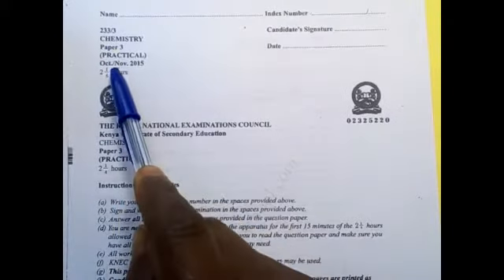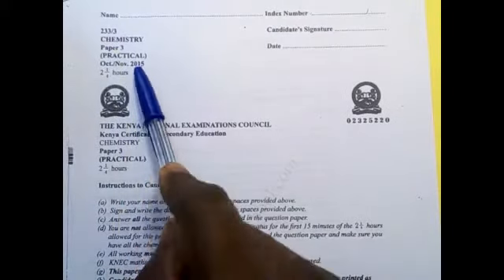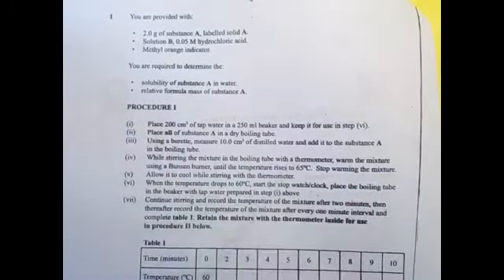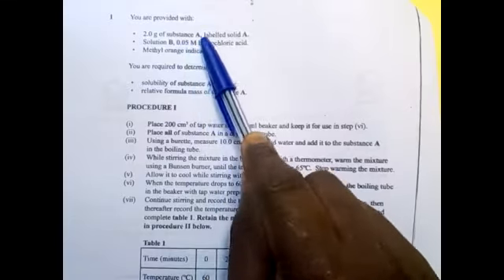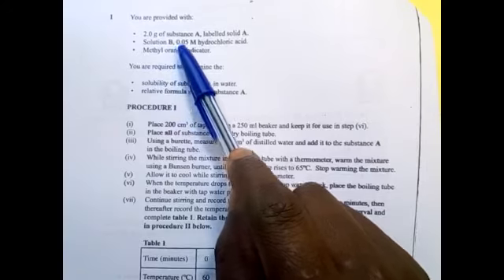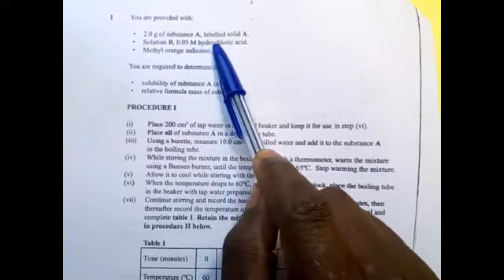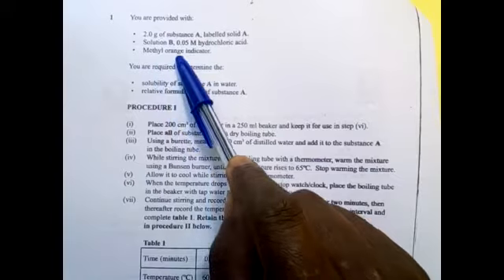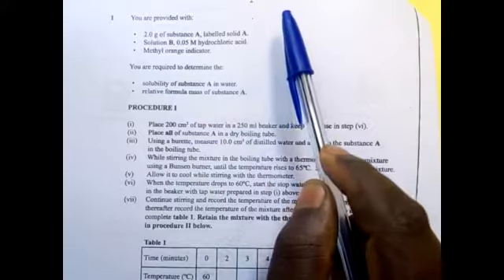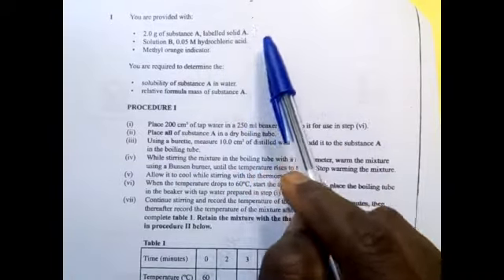Chemistry paper 3 practical 2015. I want to look at 2015 today and see what they were provided with. You are provided with 2 grams of substance A labeled solid A, solution B, which is 0.05 molar hydrochloric acid, and methyl orange indicator. You are required to determine the solubility of substance A in water and the relative formula mass of substance A.